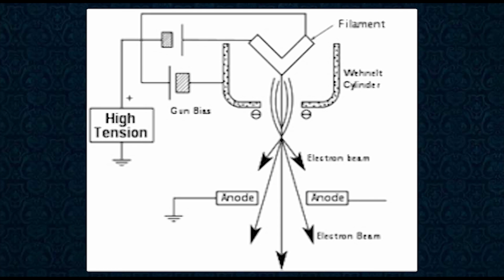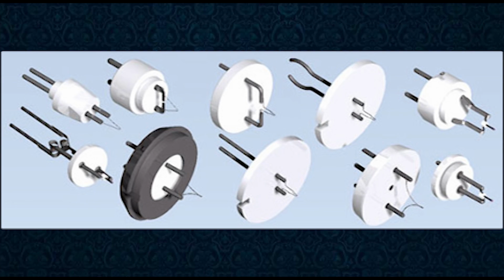The electron source is usually one of two substances, either a tungsten filament or a lanthanum hexaboride crystal. In the case of the tungsten, the filament is shaped into either a hairpin-like filament or a small spike-shaped filament, as shown here.